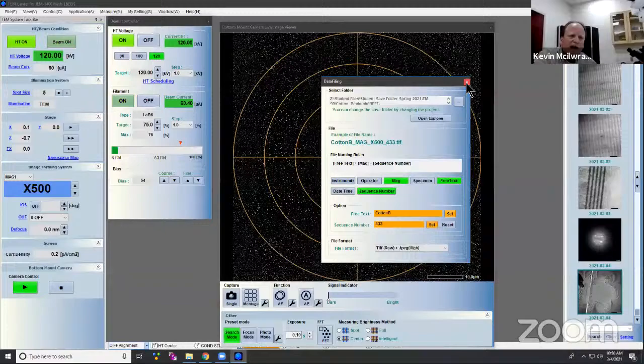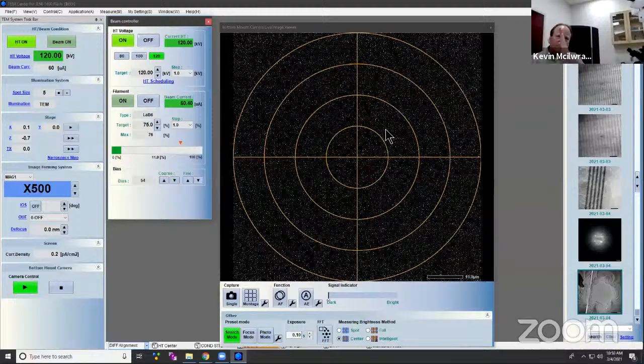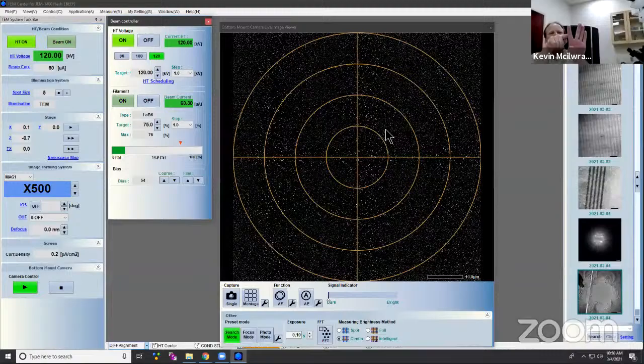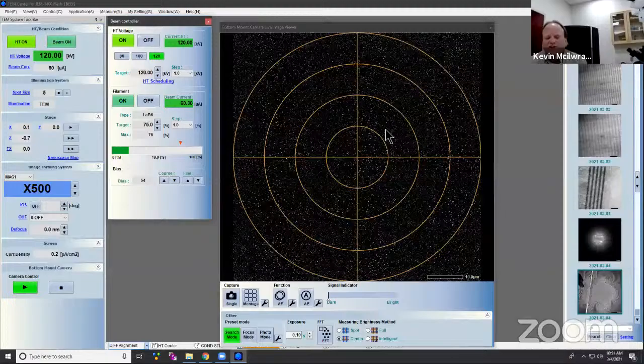I mean, you think about it, it's like that slide I showed of a slide projector, right? We have an illumination source, we have a sample, everything goes through that and then it's over here, right? If I have my hand open, the electrons are going to come through where it's open between my fingers, but they're going to stop where my finger is. So where my finger is going to be black. But the electrons that get through, it's going to be bright. So it's just a basic function of how it's either stopping the electrons.